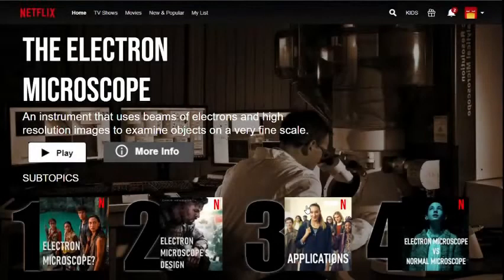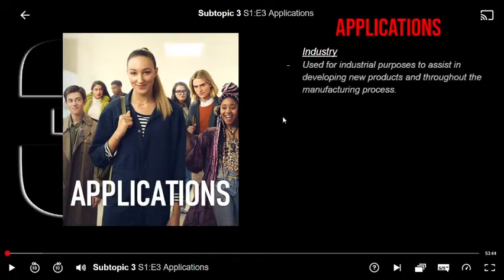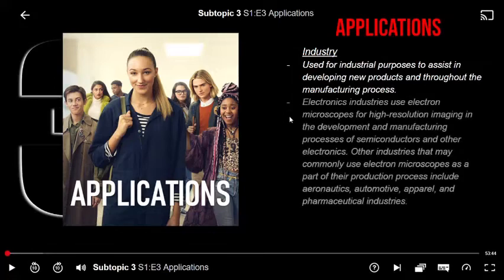So let's dive into the application. The electron microscope is widely used in industry and also scientific research. For industry, they are used for high-resolution imaging in the development and manufacturing processes of semiconductors and other electronics. For example, the industries that use EM are aeronautics, automotive, apparel, and pharmaceutical industries.